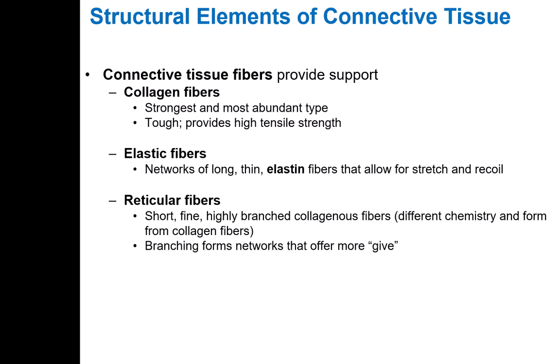Elastic fibers are long, thin, and very often squiggly under the microscope, but they don't have to be. These are responsible for stretch. And then reticular fibers are short, fine, and highly branched. They're going to definitely look more like tree branches when you look at them under the microscope compared to these other fibers.